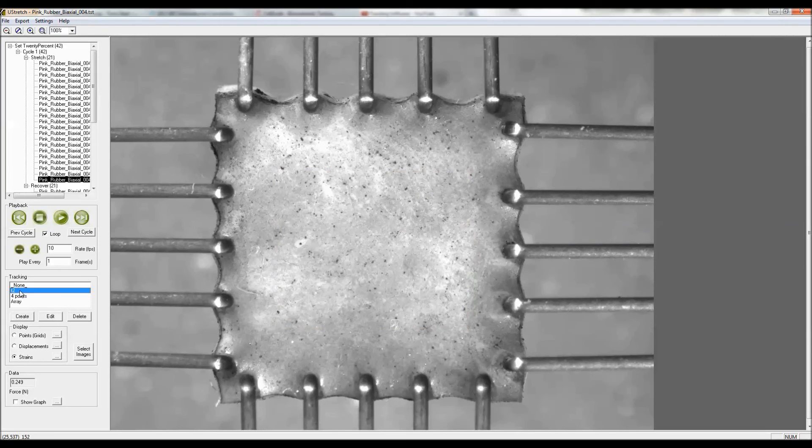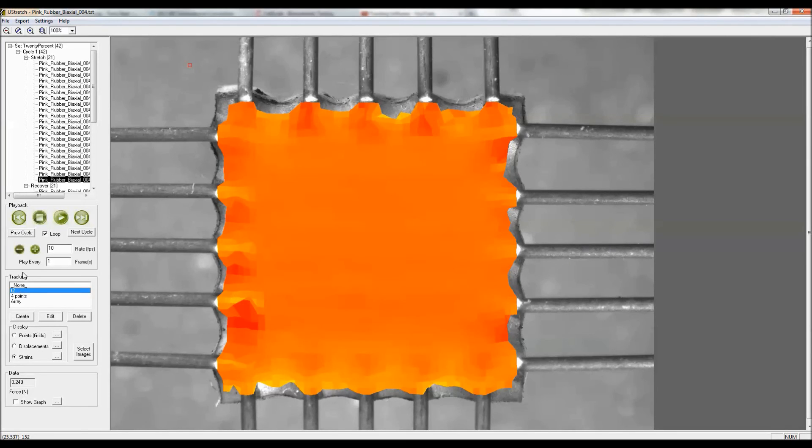I did one earlier which had a lot of points, and I'll just show you that now, which shows the kind of thing you can get by tracking a very large array of points for a qualitative understanding of what's happening in the specimen.